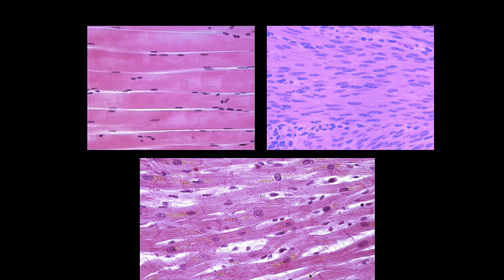Here you see the skeletal muscles, the cardiac muscles, and smooth muscles. What cells are you looking at and what are their functions? Well, you know that muscle tissues need to apply force, so they're movable. How do you differentiate between them even though they have the same function? Skeletal muscles are going to be long and cylindrical just like you see here. Cardiac muscles are going to be short and branched. While smooth muscles are going to be very narrow and elongated, so they're all very close to each other.